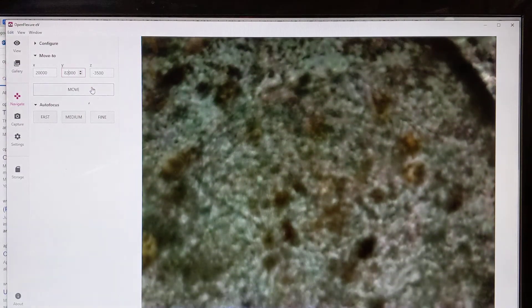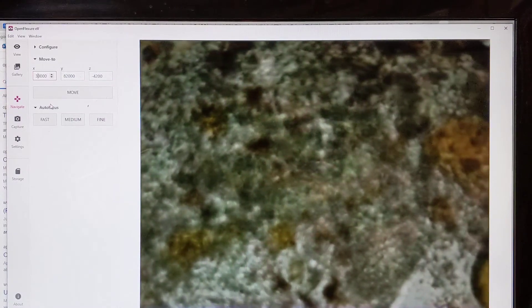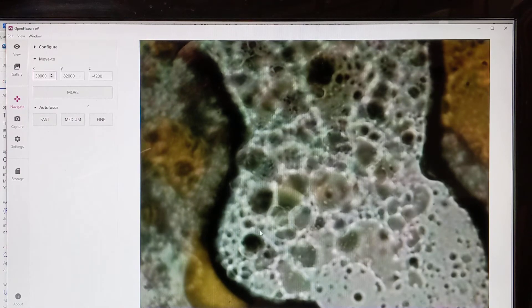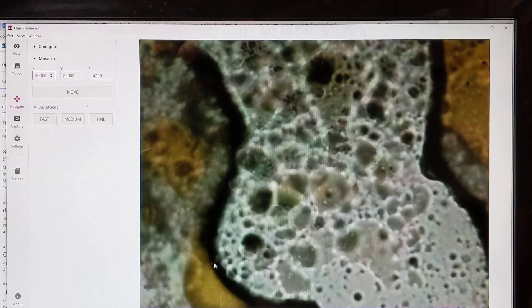This is spaghetti sauce with a little bit of cheese — not very interesting. Let's see if we can maybe get a better zoom on this. I saw a little bit of movement in there. Could be just some of the liquid moving, or it could be that I've got some little pathogens in there moving around.